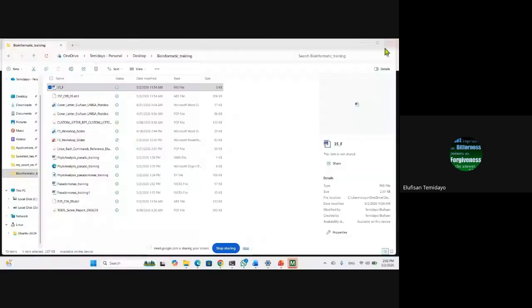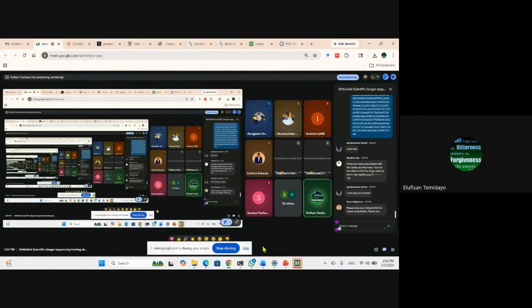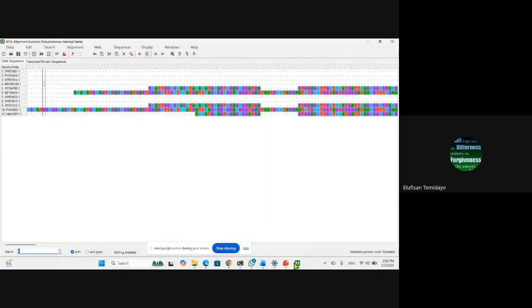Now I'm going to open. I said I'd be given 5 minutes and I'm going to round off. So I'm going to my Mega again to open this new file. Okay, let me see. I think it's ready. Okay, it's ready, so let's look at it. Do we see that there's virtually no difference between what I have and, if you have that, let me see if I can open that. Let me see if I can find that open before I continue, before I round off.